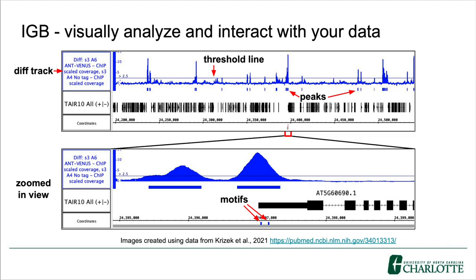To demonstrate what I mean by visually analyzing and interacting, I've included an example in IGB using data from a ChIP-seq experiment investigating binding sites for the ANT transcription factor in Arabidopsis from Dr. Beth Krizak's lab. The first thing I did was to load the tagged and untagged ChIP-seq graph tracks. I then used IGB to subtract out the untagged graph data from the tagged data, giving me the difference track that you can see in blue, where the only values remaining should be those of the tagged peaks.